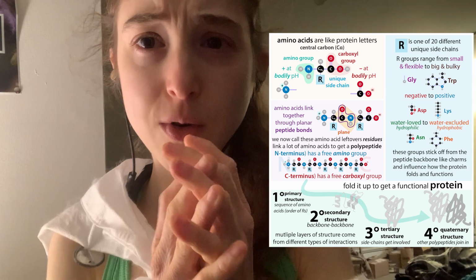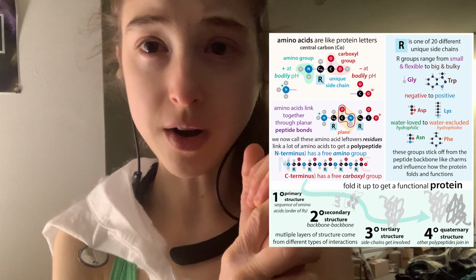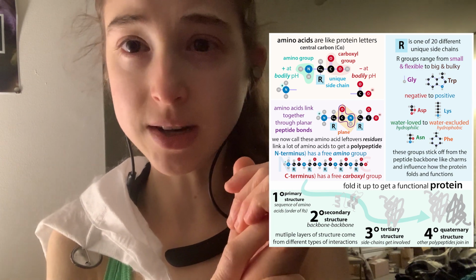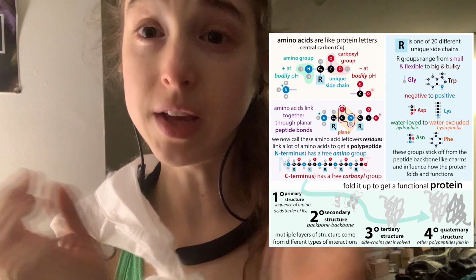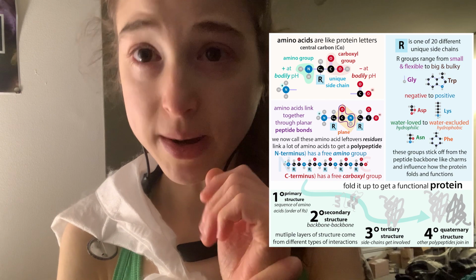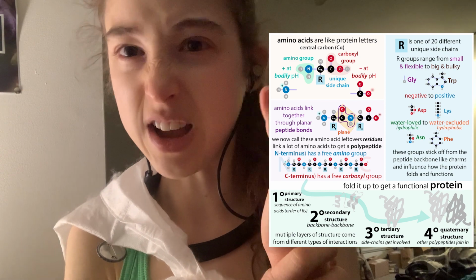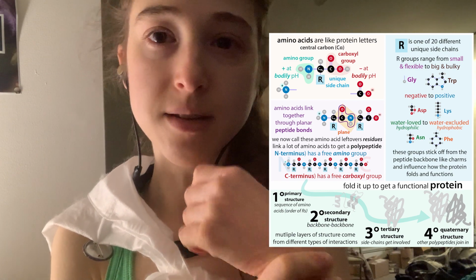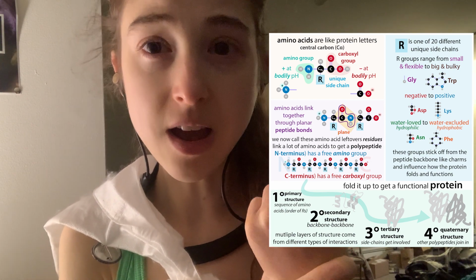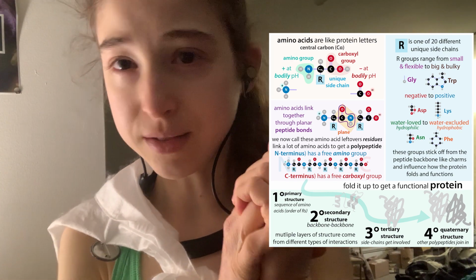And so let me tell you more about what I mean by all of this and where resolution comes from, and how you can assess the resolution of a structure and realize that the reported resolution is an overall value. But if you want to get into individual regions, some regions might have better quality data depending on how flexible a region is and how moved-around it is. And we can look at something called the B factor as well, to help get an idea of how reliable the data is for a region.